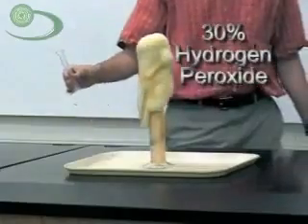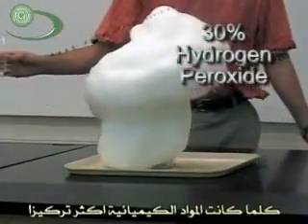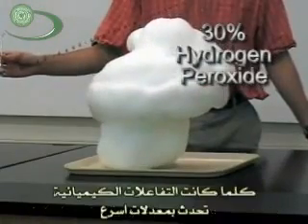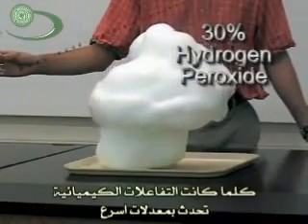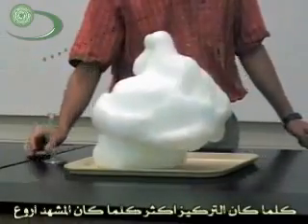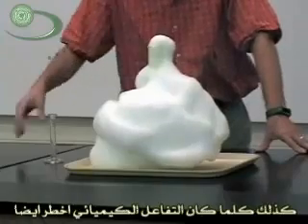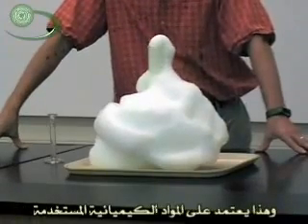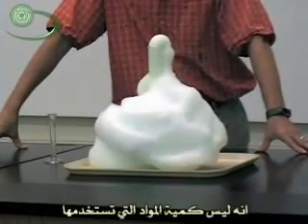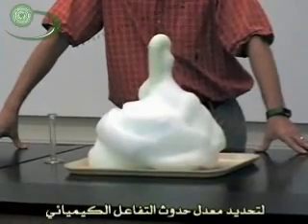Boom. There it goes. So we'll learn today that the more concentrated your chemicals, the faster your chemical reactions will happen. And as an added bonus, the more concentrated your chemicals, the more impressive the chemical reaction. Of course, it's the more dangerous chemical reaction too, depending on what your chemicals are. It's not the amount of chemicals you have, but the concentration that will determine how fast the reaction happens.